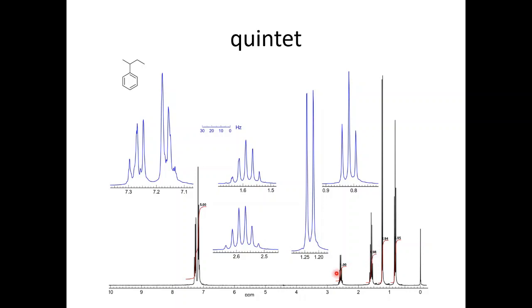The integration is 1.98, meaning two protons. The integration of the other is one proton, so this proton experiences the same type of phenomenon. Two protons here and three protons here — five total — they have similar J values, so the n+1 rule is applied.